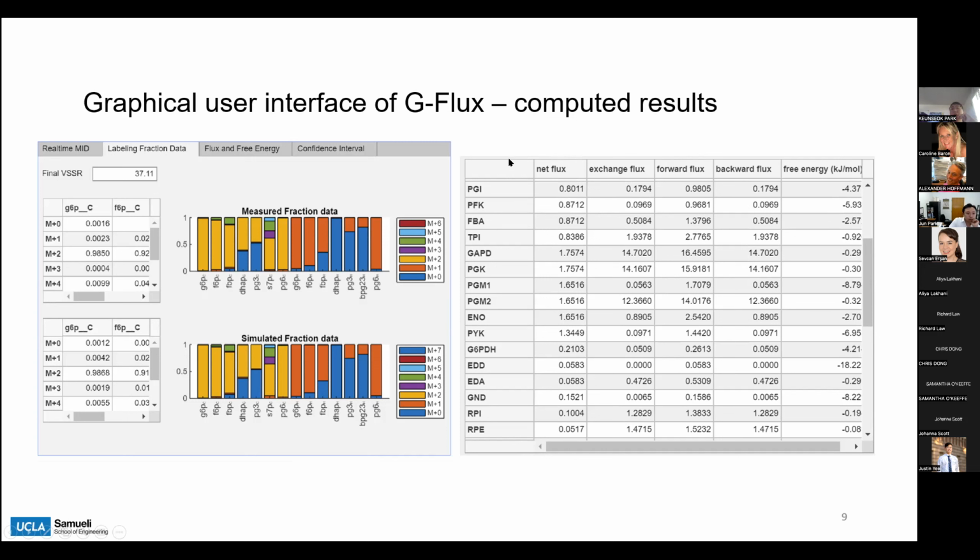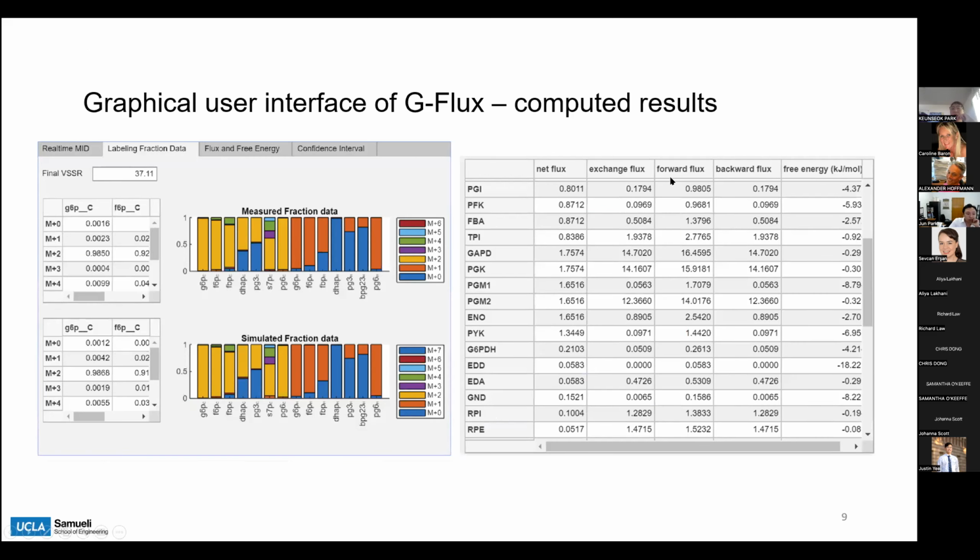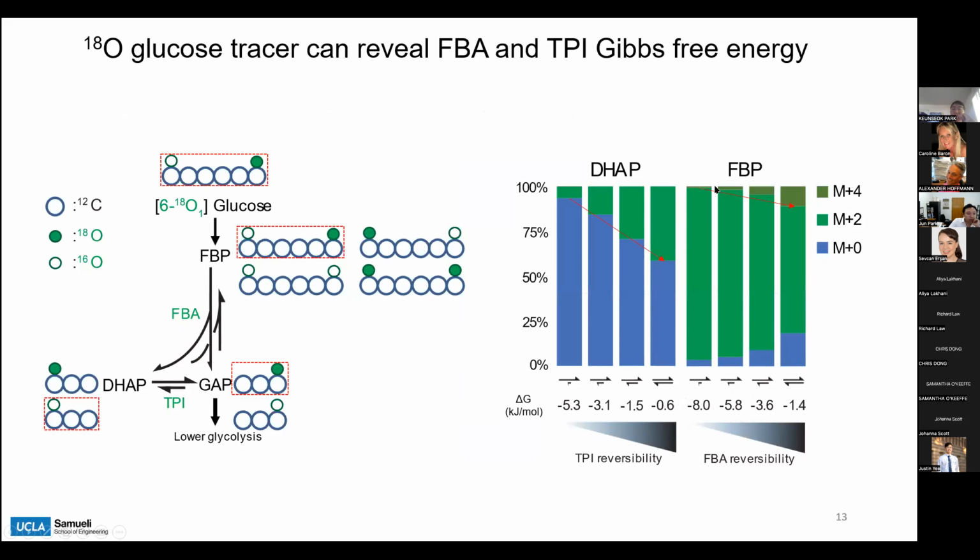So we have this numerical table graphical user interface, which shows each individual reaction's fluxes, and also finally you can see the free energy calculated on the very right. So that was the demonstration of how to quantitate flux and free energy via G-Flux.